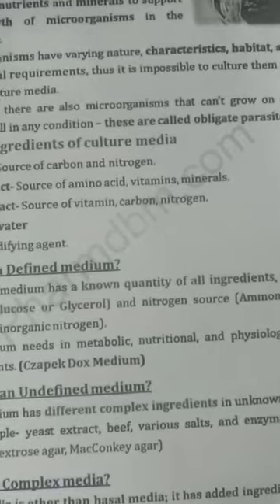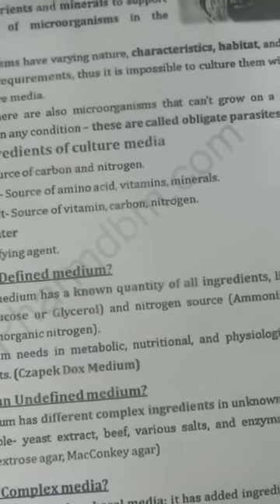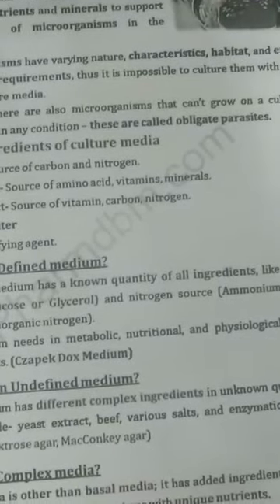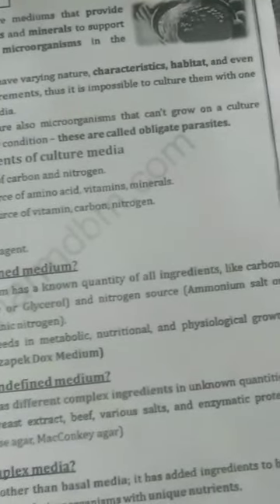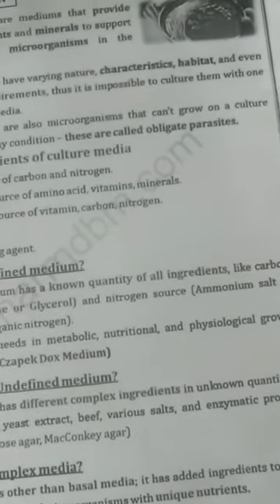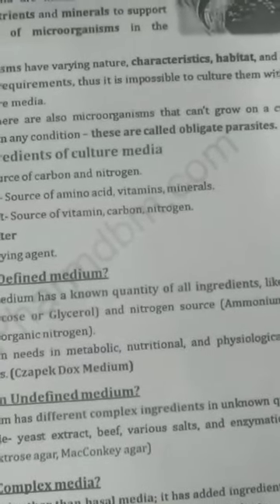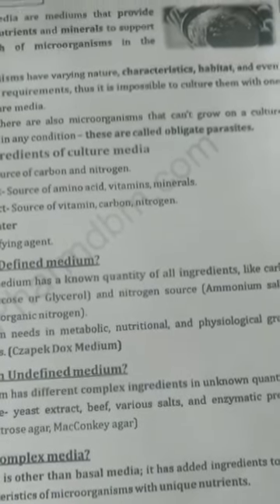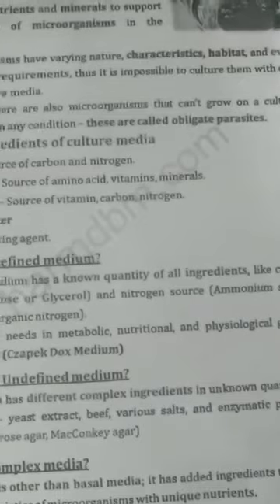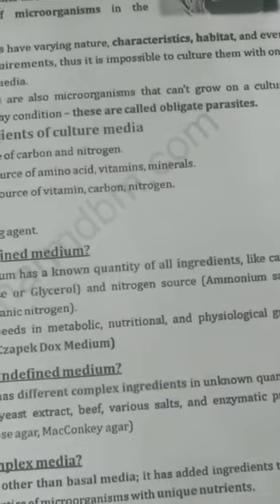Second one is semi-solid medium. This media shows the motility of bacteria and allows cultivation of microaerophilic bacteria. This medium has agar at a concentration of 0.5%. In solid media, agar concentration is 1.5 to 2%. Semi-solid media 0.5% or less. It has jelly consistency. Examples: Stuart's and Amies media, Hugh and Leifson's oxidation fermentation medium, mannitol motility medium. The growth of bacteria in semi-solid appears as a thick line in the medium.